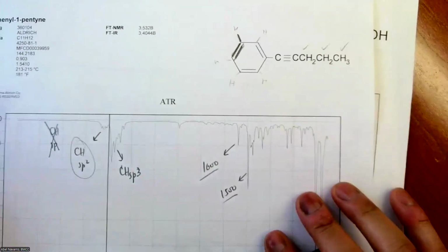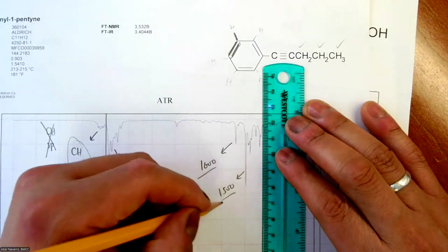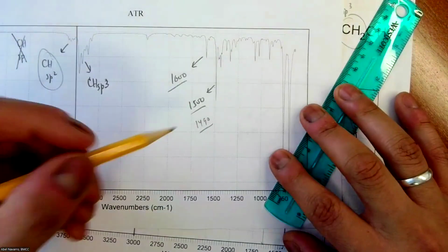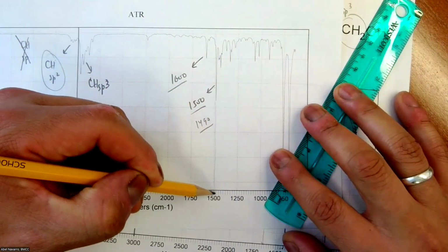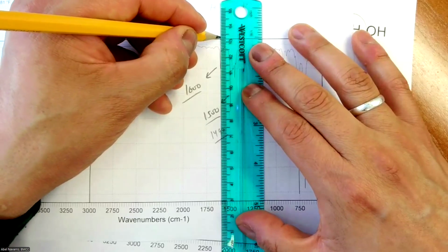Okay, so two peaks. Now, exactly what are the values? Well, I'm just giving you a range, but this one is apparently right around 1490, more or less, because the peak is right below 1500, right? And this one is 1, 2, 3. Let me put a ruler to show.